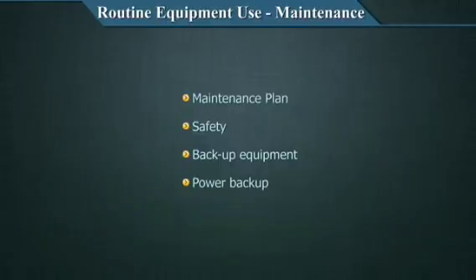And we finally talked about water quality as an important part of the utilities that you need in your laboratory. These are all concepts which are included in the equipment management, though they are smaller concepts. These are very vital concepts and should be paid enough attention to ensure the smooth operation of your equipment.